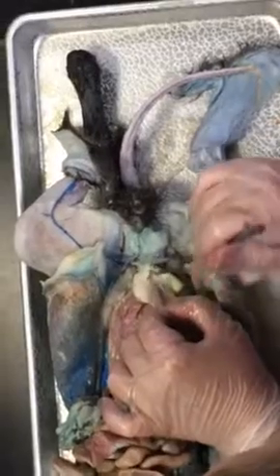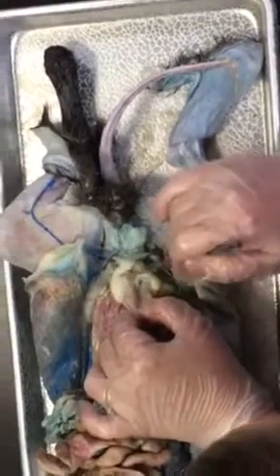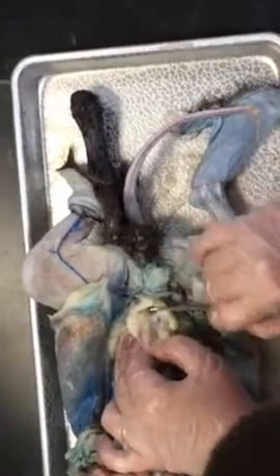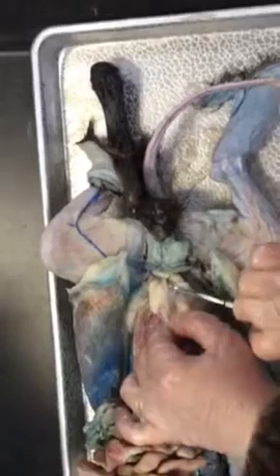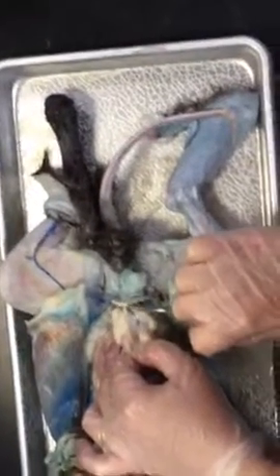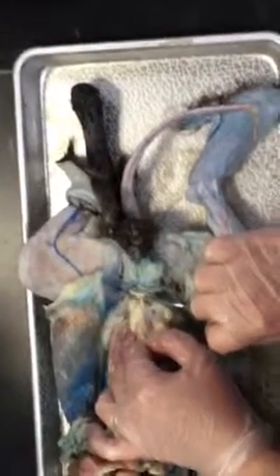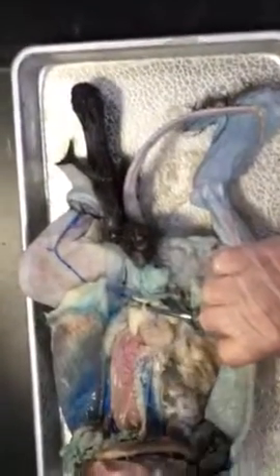And then this fat part here. There is, here it is. This tube that's leaving the bladder is the urethra. The one you got the thing in. Yeah, it's under it. Okay. It's lifting it up. This cat looks totally different than ours. Yep.